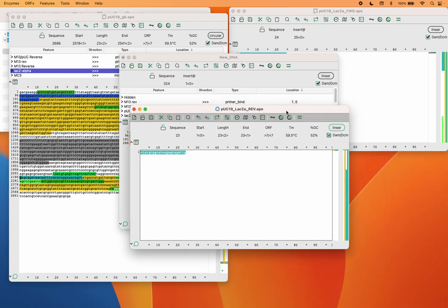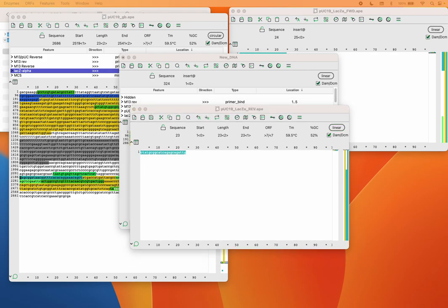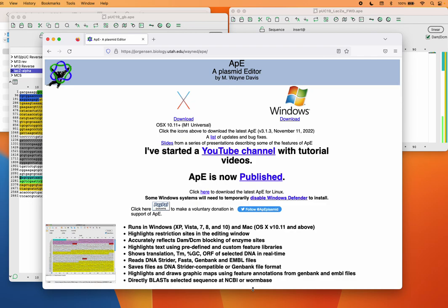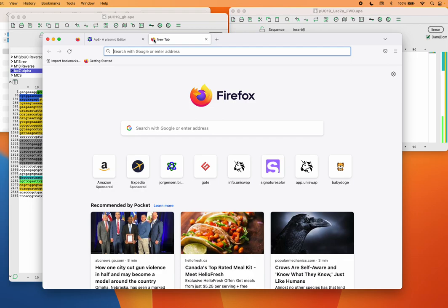Good. So the last step we want to talk about today is simply, where do you get your primers from? So we've gone and designed them. How do we actually get those? And so there are companies out there that synthesize DNA using chemistry. All right. And one such example, which is a long-standing company that provides great product, is IDT.